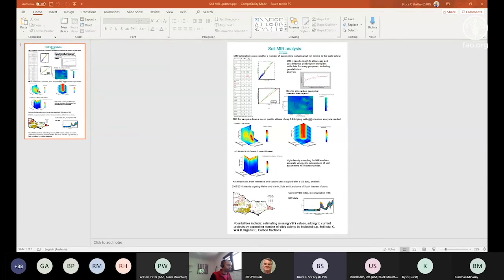All of our work has primarily been focused up until a few years ago on servicing research needs, so it needed to be perfect, if you like. The big issue we find, some soil samples, it doesn't matter whether you're using less than 2 mil, but for others it's critical that you're using fine grind. We just have one system rather than trying to figure out what the soil's like, whether we get by with 2 mil or not. We just have a one size fits all.